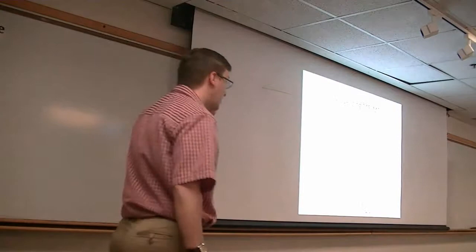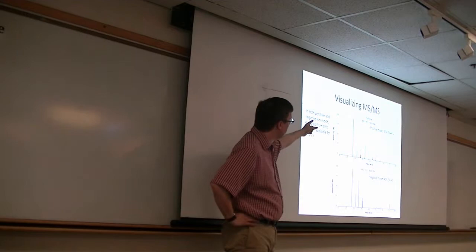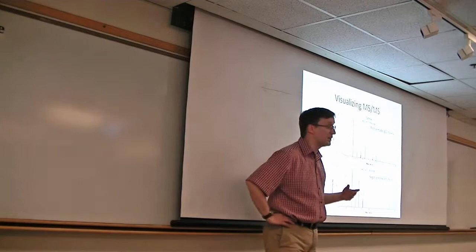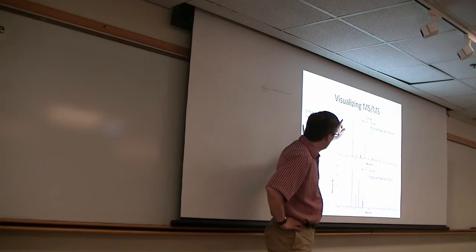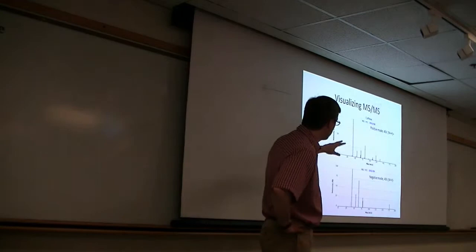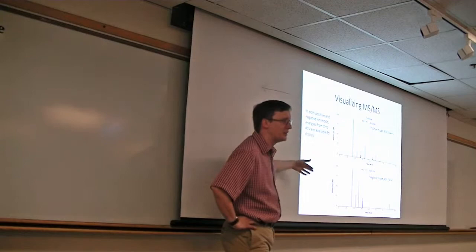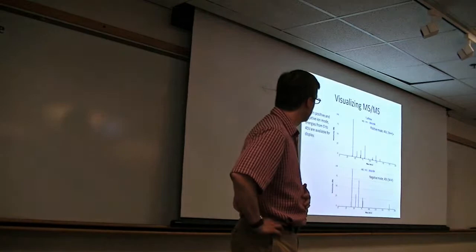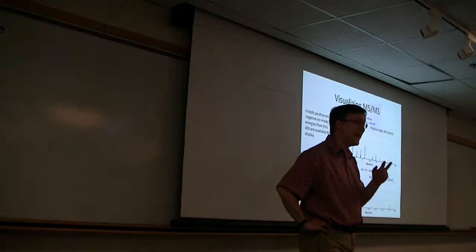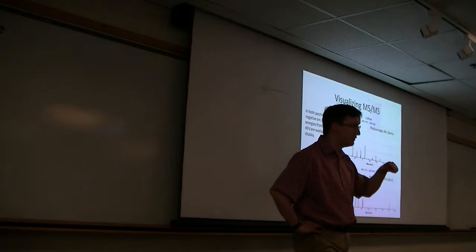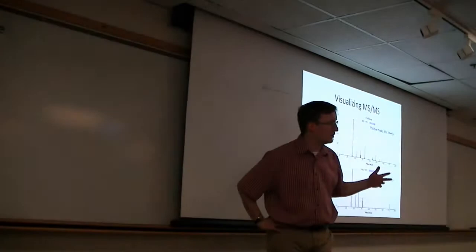So when we do the visualizations here, we see that the database contains both positive mode and negative mode spectra for this. We can look at them. In this case, these are data taken from a QTOF. So we see that the fragment ions that we see are related, but they are somewhat different as we go between the two polarities. And helpfully, multiple energies are available here. Although I've visualized the 40 volt ones, we can scale that down a bit and see how different the fragments are that are produced from it. I guess it's worth noting here that the mass that the ion takes on when we do this in positive ion mode is different than the mass when we go in negative mode. So we've got the removal of the hydrogen, the addition of a proton, etc. Sorry, what? Oh, I thought I heard a comment. Sorry.